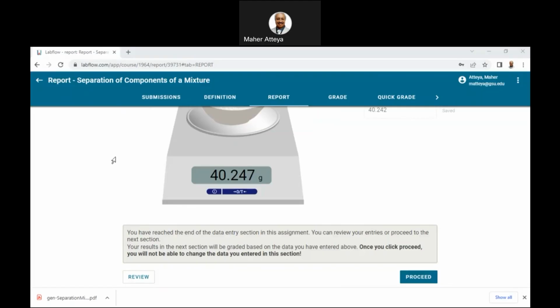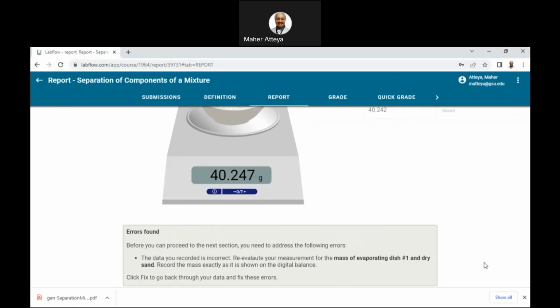So it is. And proceed is here. Copy and paste here. Okay, so here it is. We are on this one. Save everything. Let's proceed. Okay, click on proceed. So I'm clicking proceed.